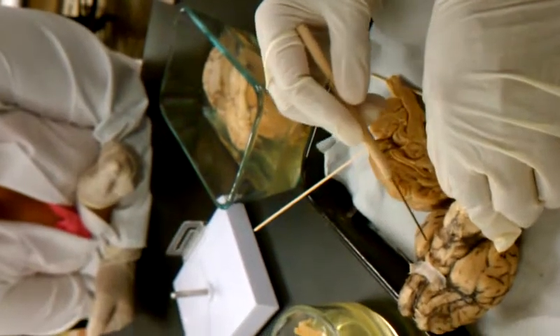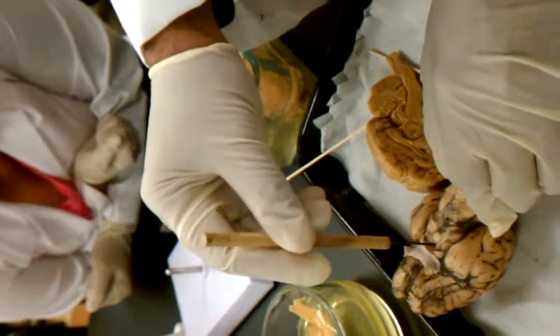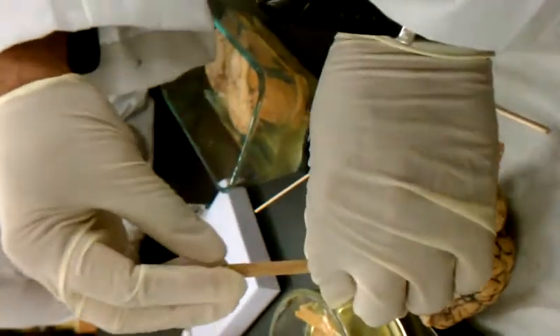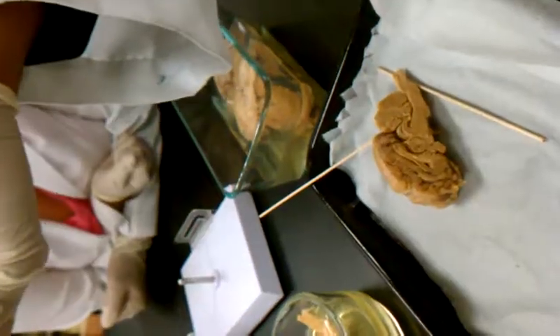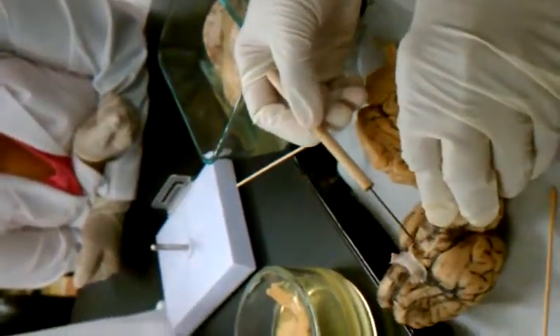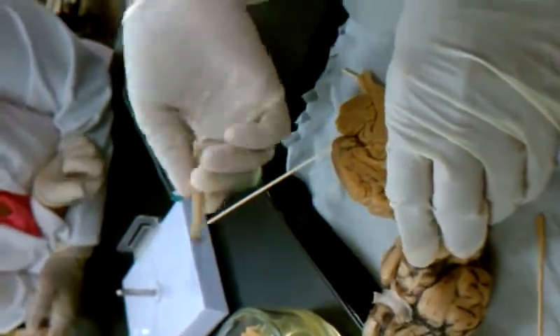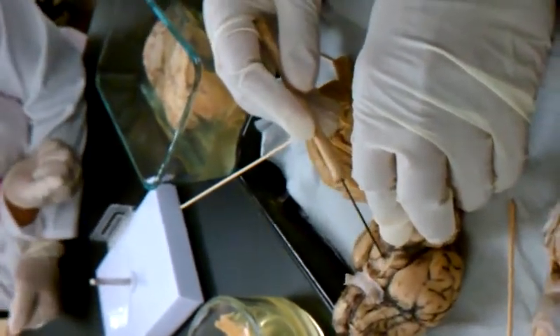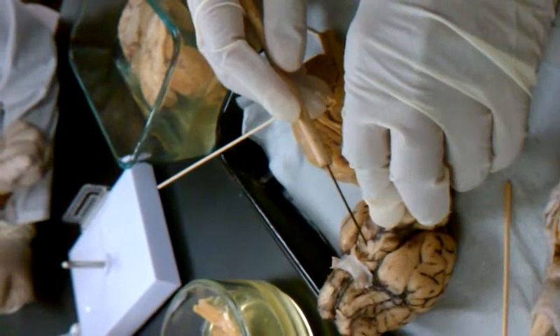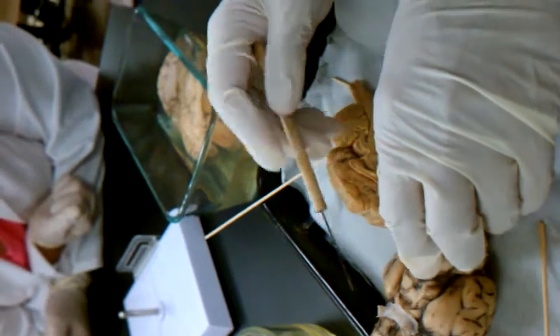Infundibulum, mammillary body. This is your infundibulum. Actually, it's not the whole. The pituitary gland is here like my hand. It's hanging. You do it this way. So the stalk is the infundibulum, but it breaks off. So they refer to the attachment point as infundibulum, the hole. So practically you can think of the hole. If it's uncovered, then it's the hole. So this is your mammillary body. That's below the hole. Pons.